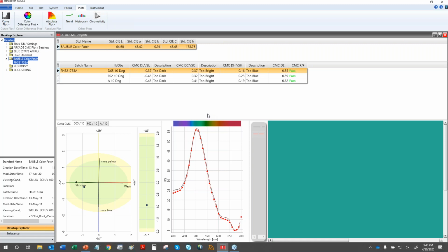Those again are some of the graphic capabilities we have in Datacolor TOOLS to supplement the tabular data for color differences. Using those all together, you can move quickly into a more digital workflow where you can improve your overall throughput and improve your overall quality. If you have any questions on the graphics or want more information, feel free to reach out to Datacolor. We're always available to assist, and you can review the recordings again to get more pointers on how to use these graphic tools.